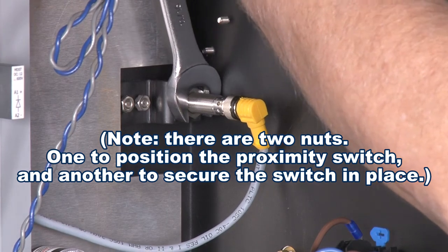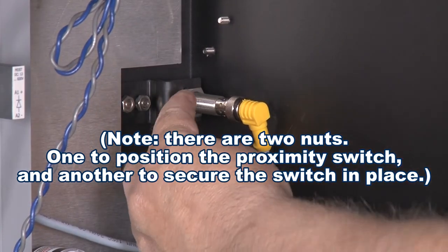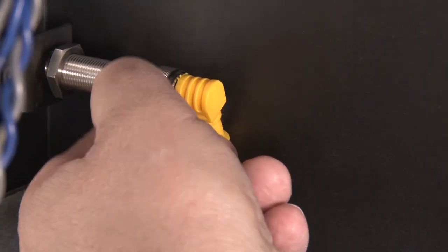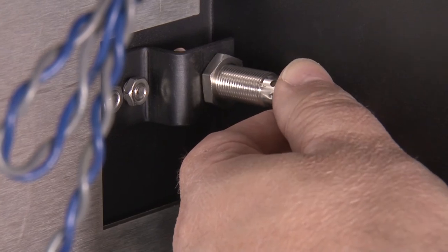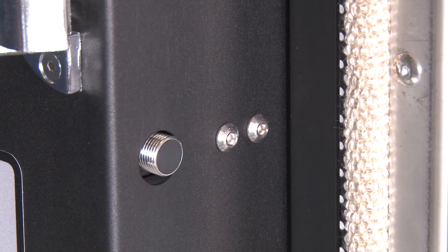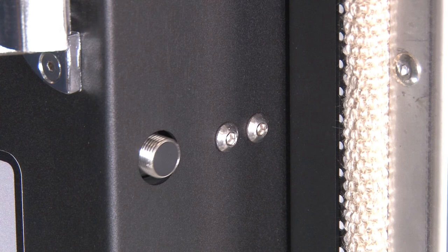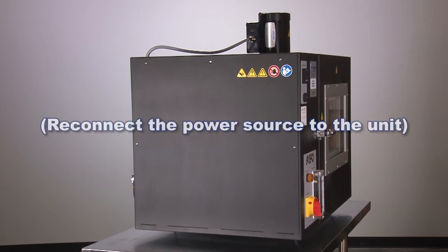To adjust the mechanism, loosen the nuts on the proximity switch bracket. Unplug the cable from the back of the switch, then position the switch in or out to the correct orientation. Retighten the nuts, reconnect the cable, and return the side panel to the unit.